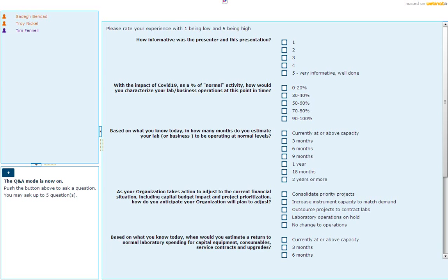Okay, a couple questions on TGA. Just maybe talk a little bit about the atmospheric options, and I think specifically, can you blend gases in the high pressure TGA?